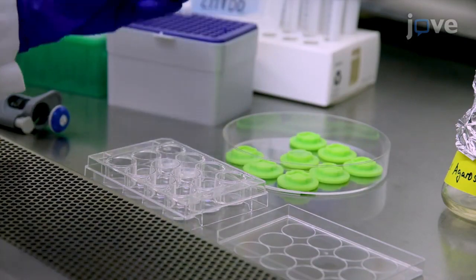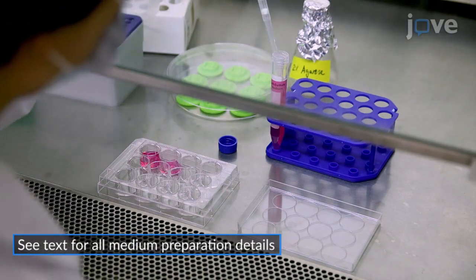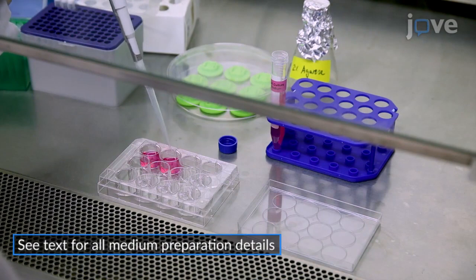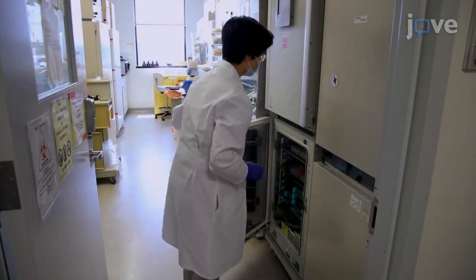a 12-well plate. To equilibrate the casts, add 2.5 milliliters of cell culture medium supplemented with 10% fetal bovine serum into each well, and place the plate into a cell culture incubator for 1 hour.